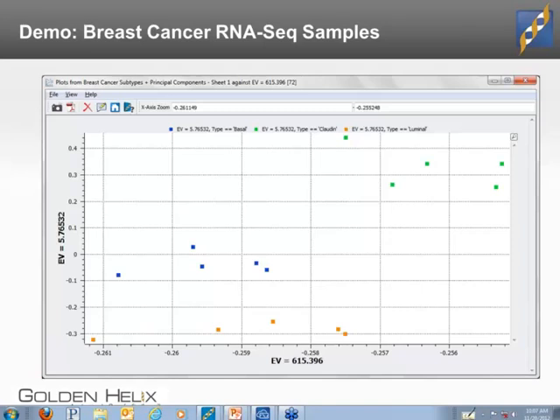The demo will start with the data already imported into SVS in a phenotype file joined to the read counts per gene spreadsheet. Then we will interactively run DE-Seq between the claudin and the luminal groups. From the DE-Seq output, we will generate 2 plots. Of course, you can do all of this yourself using our tutorial. Finally, we will show you our top 2 genes in Genome Browse. Now let's switch over to the SVS project.